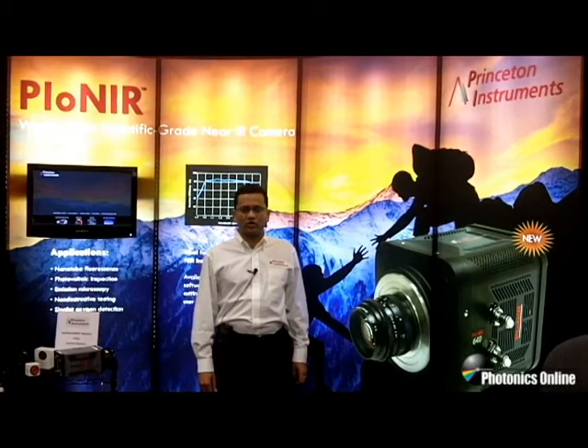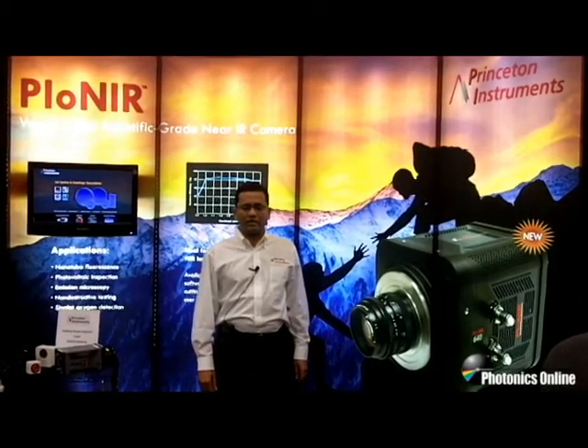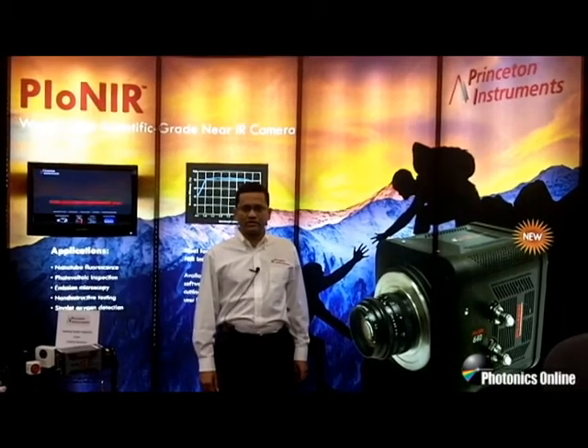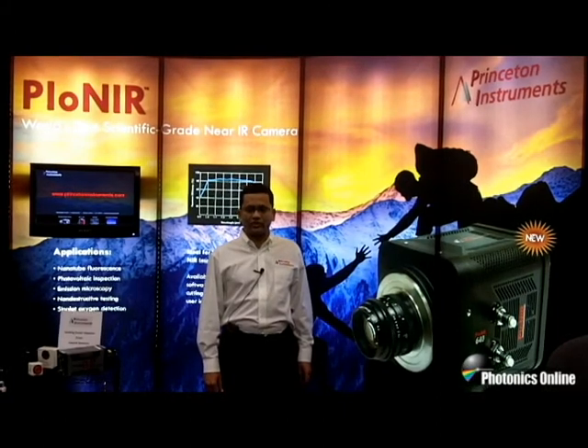Princeton Instruments is a world leader in low-light level detection, imaging, and spectroscopy, and we provide CCDs, EMCCDs, ICCDs, and InGaAs cameras for the scientific community.